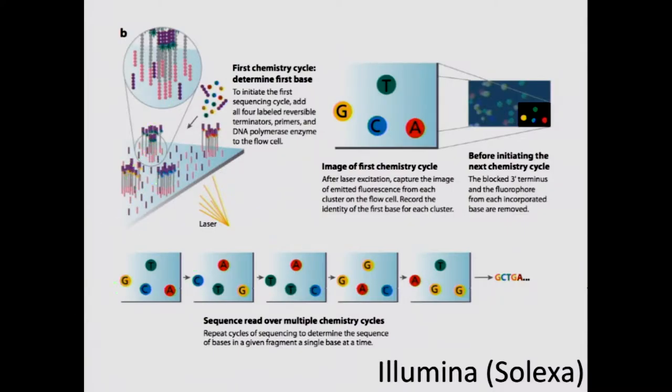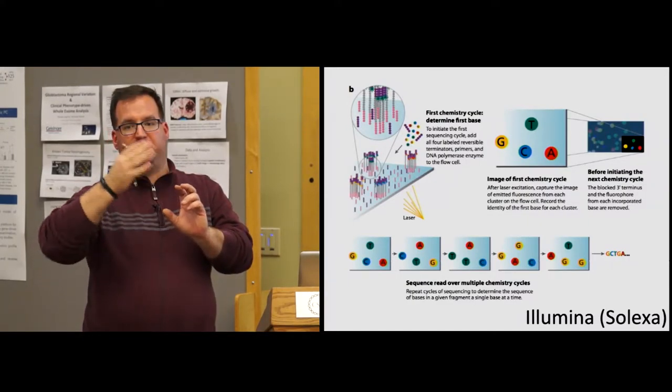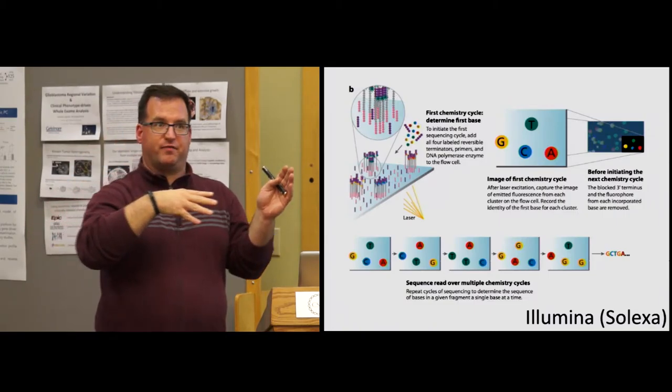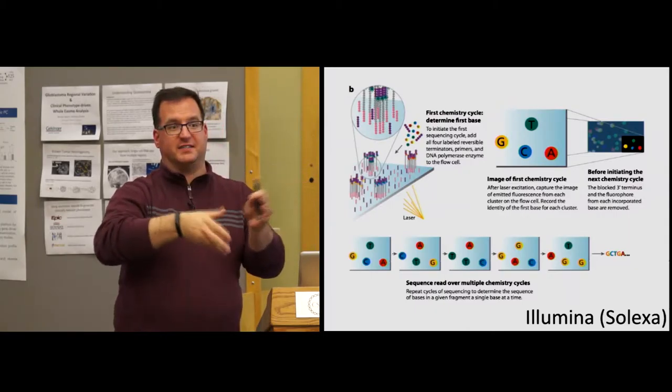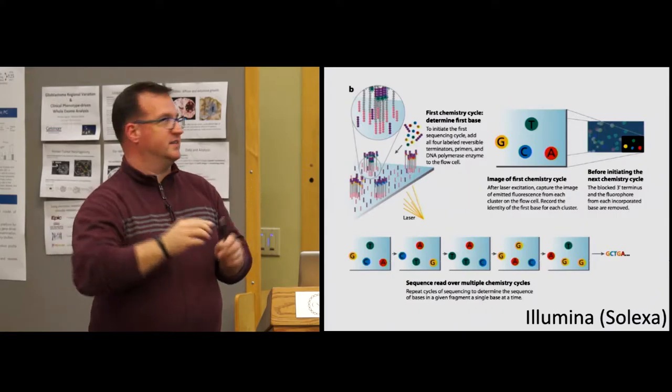Now you can do a set of cycling reactions using, again, dideoxy and fluorescently labeled nucleotides, in this case using different colors for each of the four different nucleotides. In each cycle, we can float in all four different nucleotides, and we can snap a picture. For any given polony, it will incorporate one and only one nucleotide because it's dideoxy on the other side, so it's blocked from continuing on. So in case there is a homopolymer, it can't. In the 454 situation, when you floated in adenine, and if there were three adenines, they would incorporate all three of them and release three pyrophosphates. Here it can only incorporate one because the chain is essentially blocked.